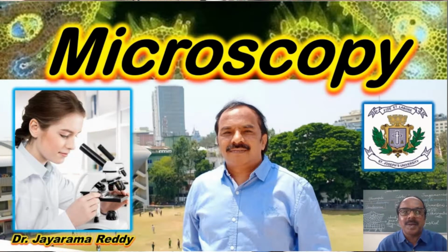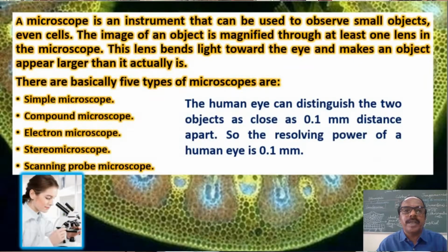Welcome back and welcome to a new video on microscopy. The microscope is a very important instrument in biology, with the help of which we can see objects that are normally not visible to the naked eye. The resolution power of a normal human eye is 0.1 millimeter, so we need to use a microscope to see anything beyond that.